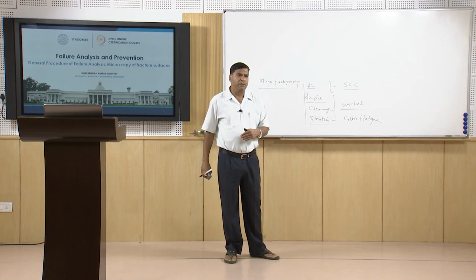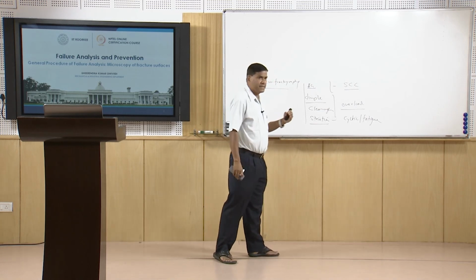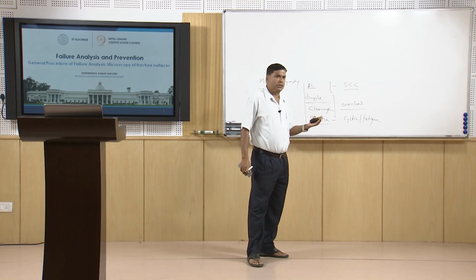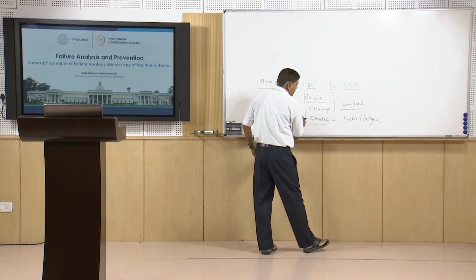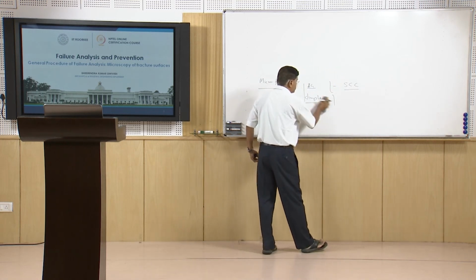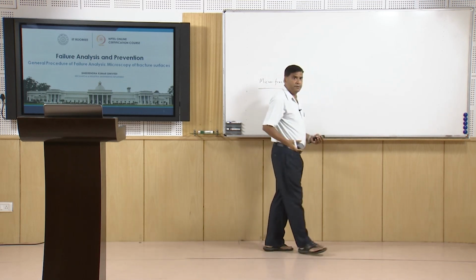So, the type of load, whether it is overload, cyclic loading, shear load or torsional load, can be identified through these microscopic features present on the fracture surface.